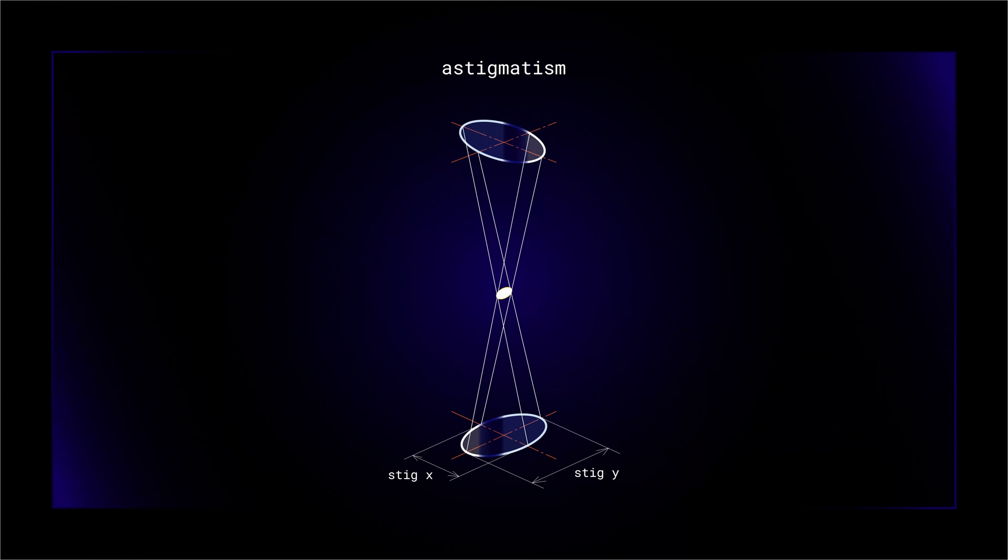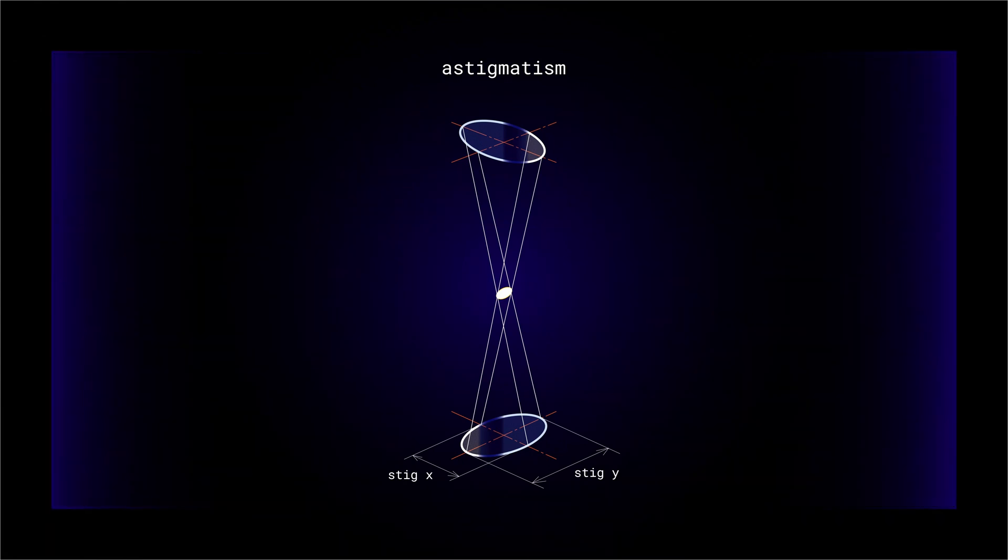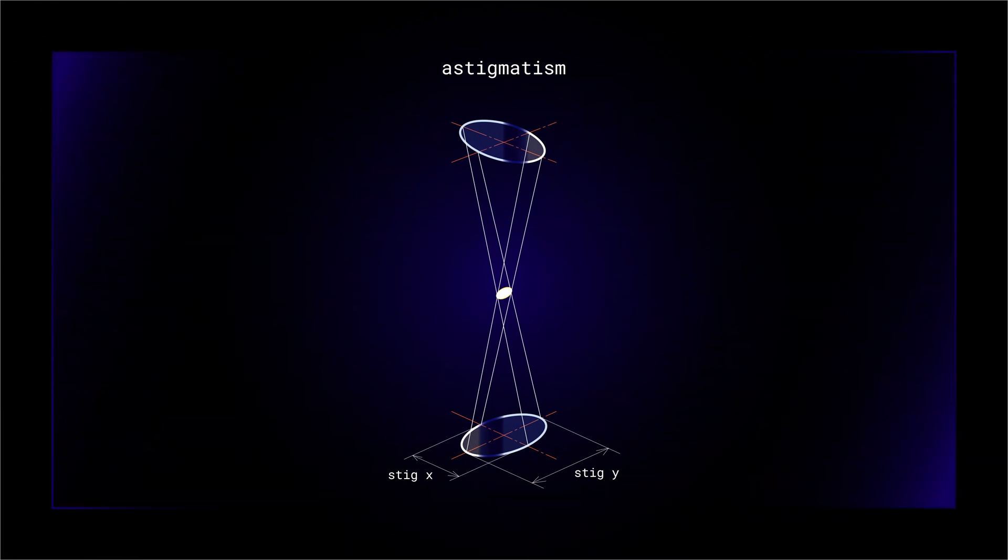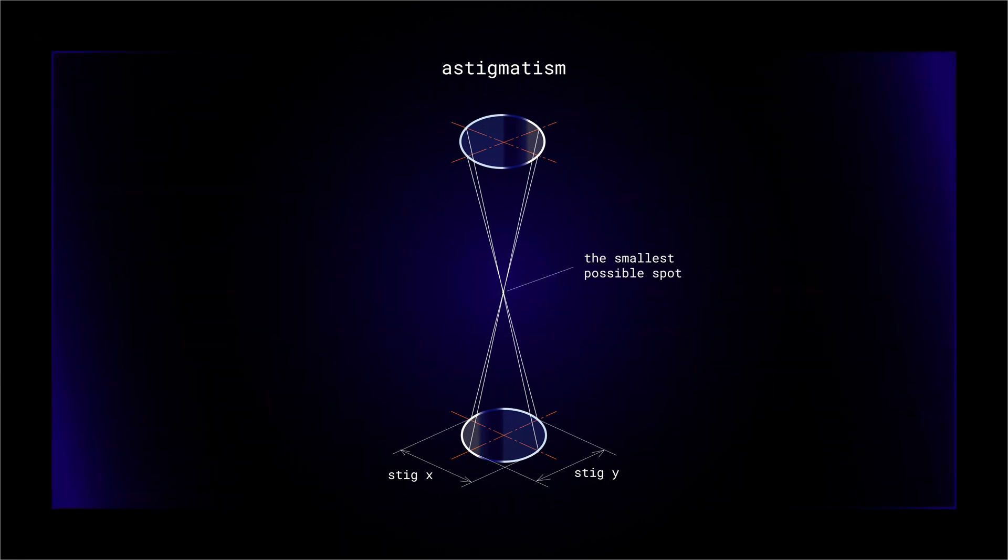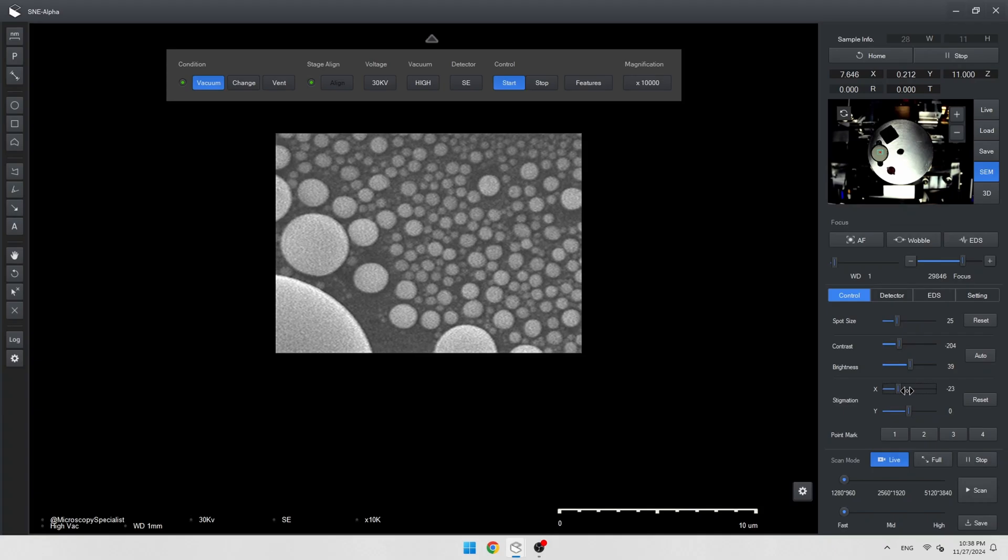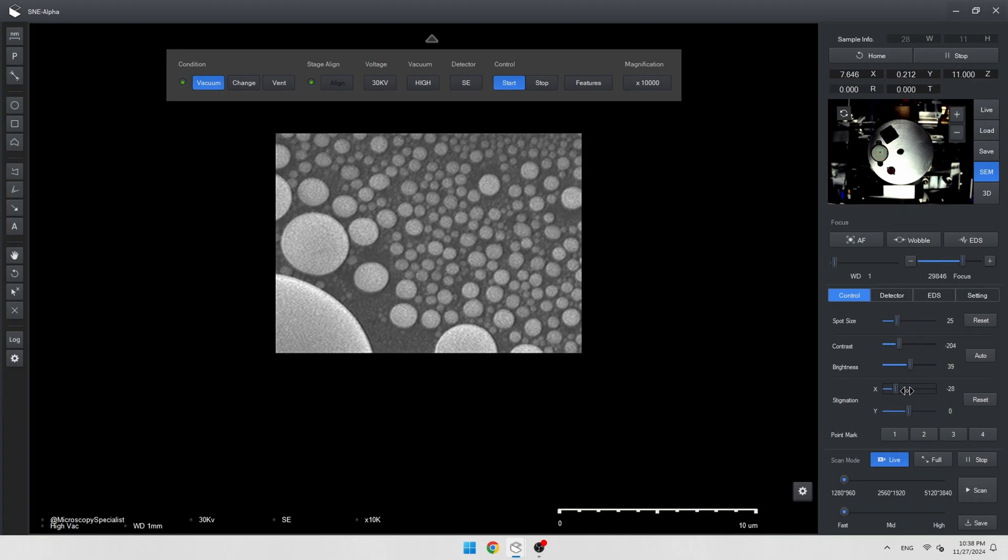Second point. Stigmation. We need to correct the astigmatism of the beam using the stigmator. The main idea is to make the image sharp on both axes without blur. We should clearly see round spheres. It's a tricky thing and we need to spend more time for obtaining the results.